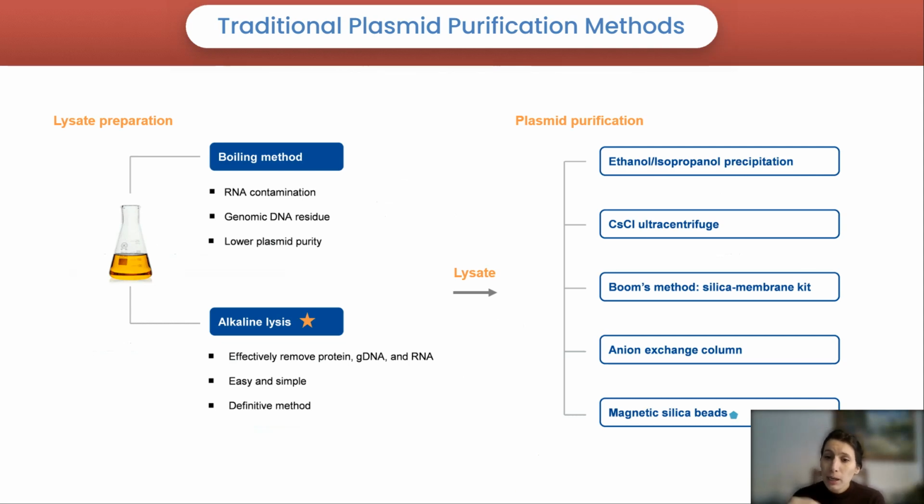So I think that I probably am not presenting anything groundbreaking here, but I did want to mention that plasmid purification has been around for many, many years. I think the initial identification of a plasmid was in the early 70s, where they were able to isolate it. And quite a few methods have been developed to extract that plasmid. Of course, we're all very familiar with the ion exchange column methodology. That's really where a lot of the development has been focused.